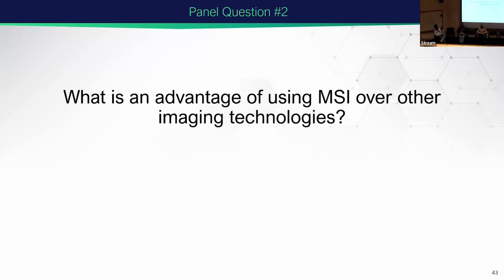As Youngjin mentioned, a lot of this will be solved in the future, but right now it's one of those ambiguous portions of where we currently are. Relative quantitation within the spectra is up for debate. I tend to lean on the side that we're relatively quantitative, but absolute quantitation is very, very difficult.